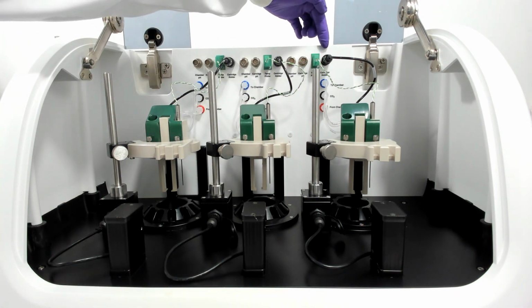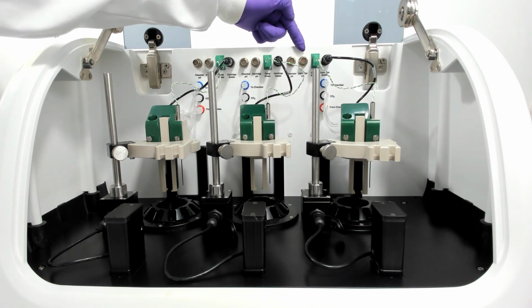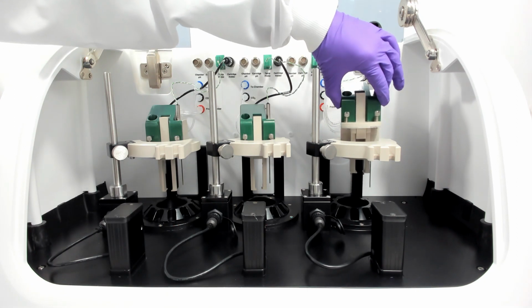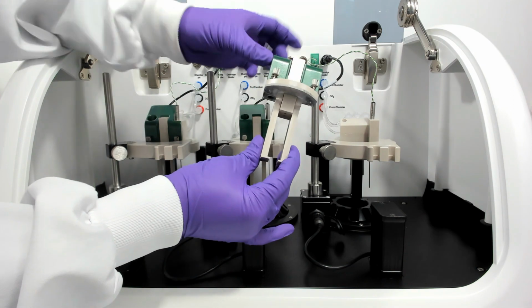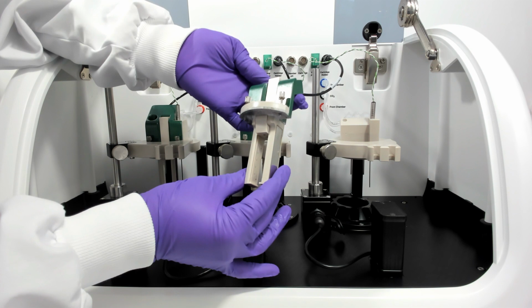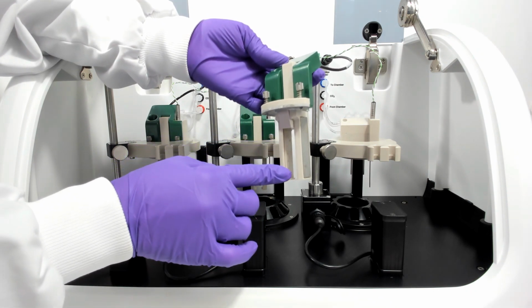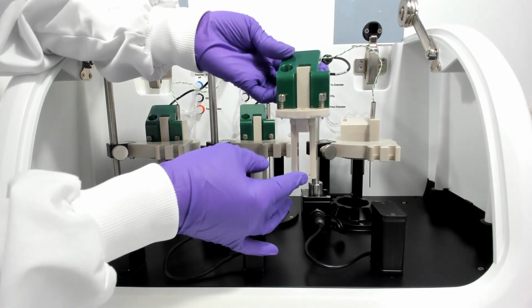We then also have a cartridge holder, thermocouple, chamber pH electrode, and cartridge pH electrode. We then have our cartridge holder, and this is where our cartridge filled with our artificial extracellular matrix will sit. And we have LEDs and diodes on either side of the cartridge, allowing for light transmission or turbidity to be measured throughout the assay over time. And this is looking for that physical instability of your formulation upon injection, any precipitation or aggregation events that may occur.